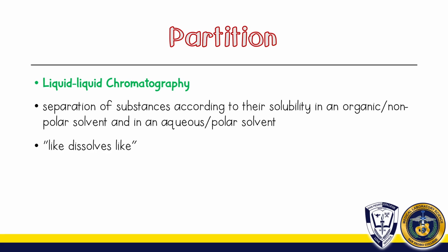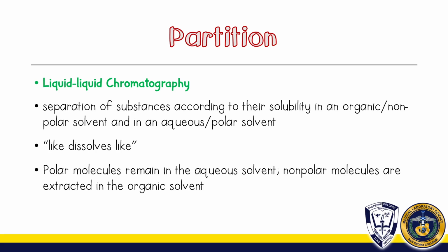Now, here in your partition chromatography, since we are talking about liquid to liquid chromatography, the principle behind this is that like dissolves like. Solubility is our basis. And polar molecules remain in the aqueous solvent. If the aqueous solvent is what we use, then polar molecules will remain. If it is a non-polar molecule, non-polar molecules are extracted now in the organic solvent.